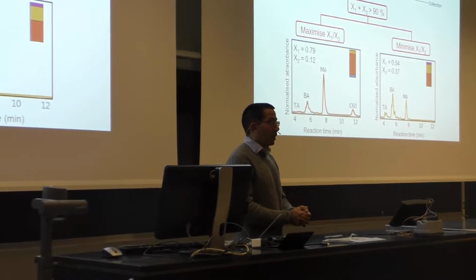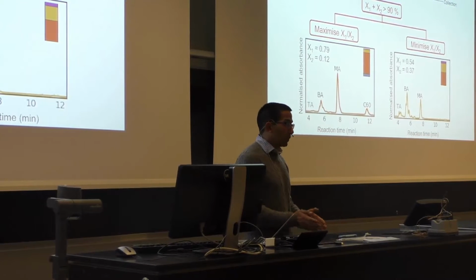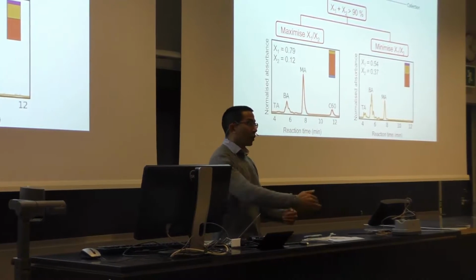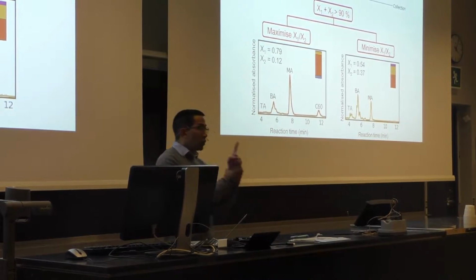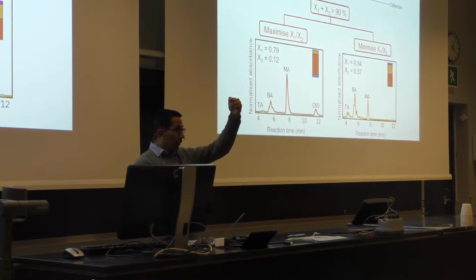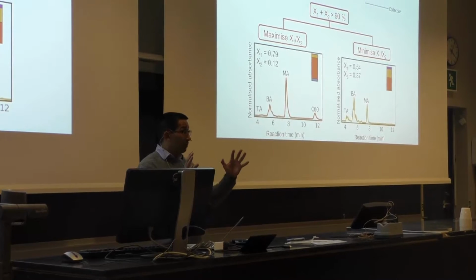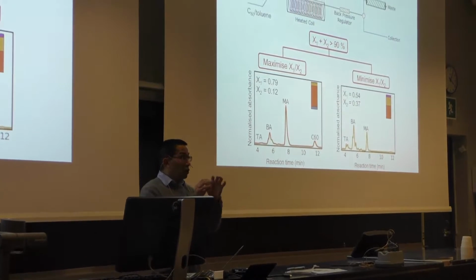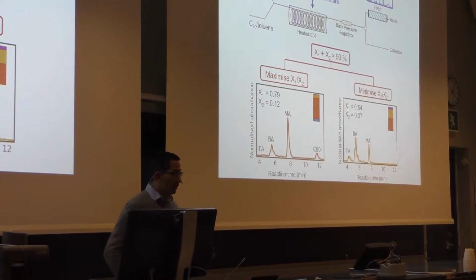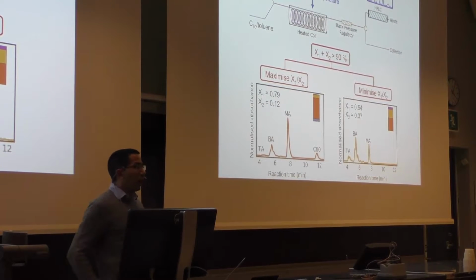A typical way would be to test 10 different temperatures and 10 different compositions, with one data point for each temperature and one for each composition. So you only have 10 data points in total, but you've in some sense tested out a parameter space of 100. You've sampled it sparsely.